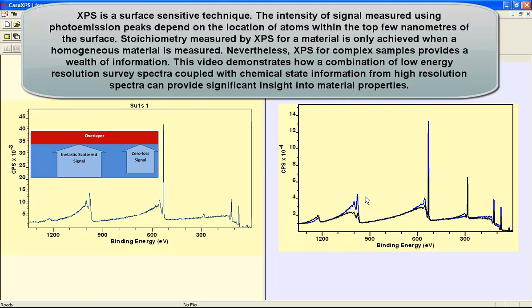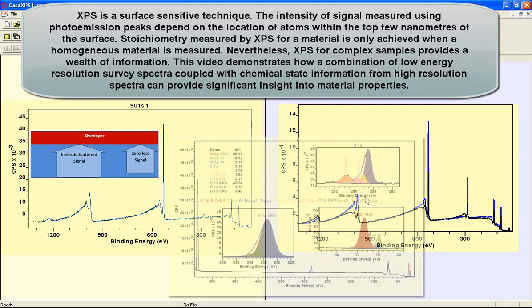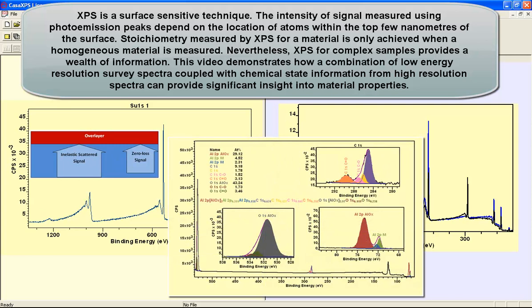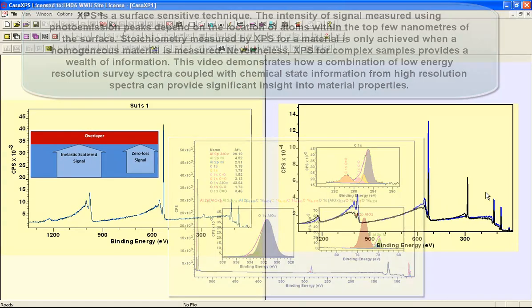However, survey spectra do not represent all the information that's available by XPS. And if we want to investigate these samples with layered structures in more detail, then high-resolution spectra are required. These high-resolution spectra provide us chemical state information in terms of photo emission peaks and chemical shifts that are just not available within survey data.